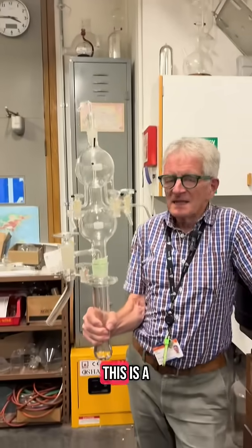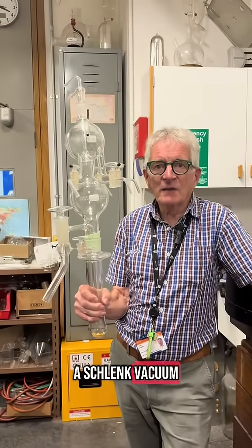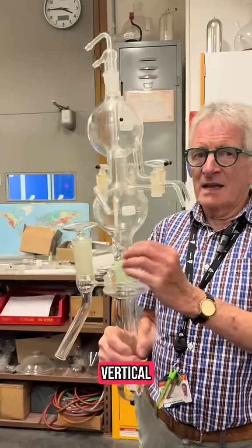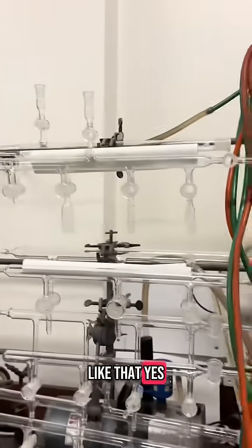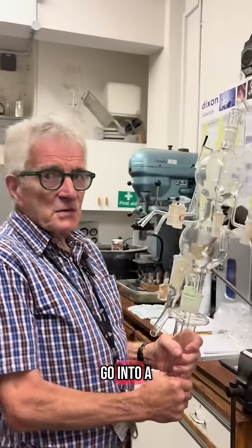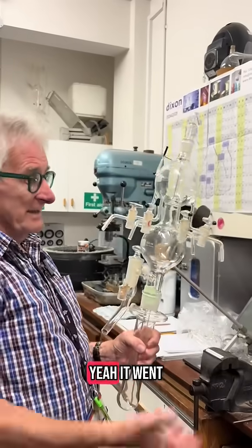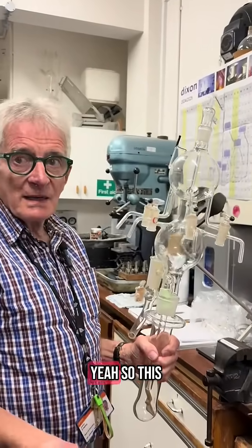What is this? This is a vacuum line, a Schlenk vacuum line — it's amazing. It's vertical, yes. Normally they go like this, but this one I designed years ago to go into a fume cupboard. So instead of going across the fume cupboard, it went up, which meant it gave them more room.